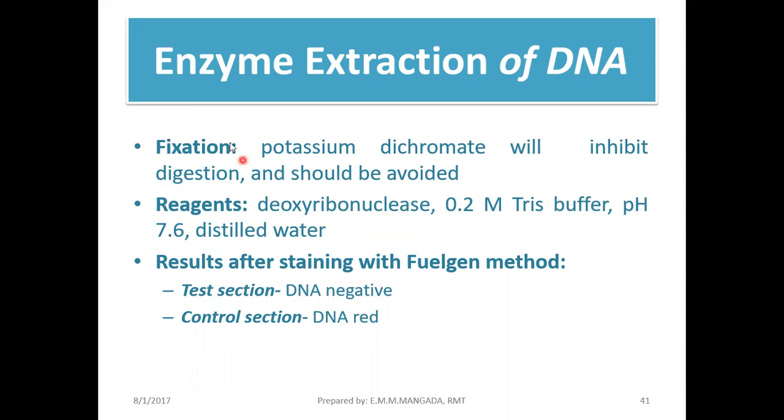So example, we have the enzyme extraction of the DNA. So guys, now we're going to extract the DNA using an enzyme deoxyribonuclease, di ba? So if, for example, this is your cell, it has DNA in the nuclei. So to confirm kung yung na-isolate ba natin na nucleoprotein is really DNA, we're going to perform an enzyme extraction procedure.